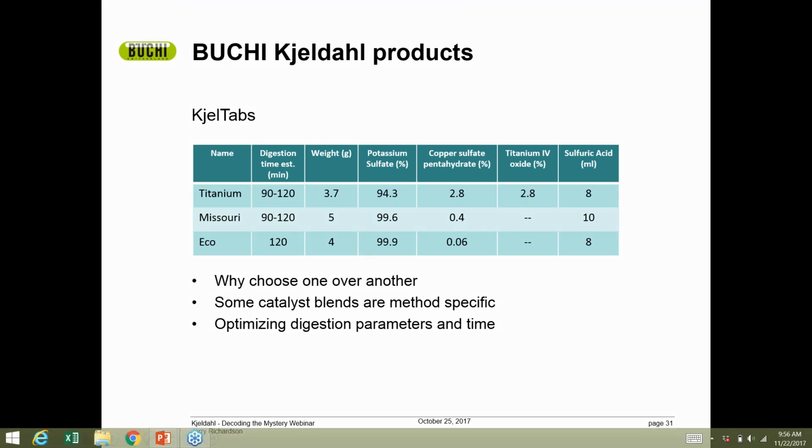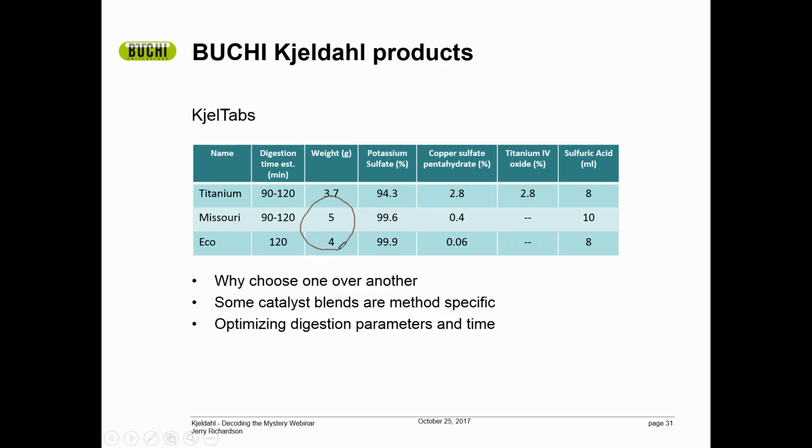The one thing I want to point out to you is take a look over here and here. We talked about our ratio of 2:1 of the concentrated sulfuric acid to the gram weight of the tablet. So we want to start off at least at a 2:1 ratio. And I say at least 2:1 because there are times where fatty acids and other hydrocarbons can come into play.